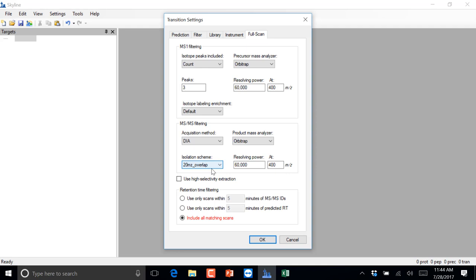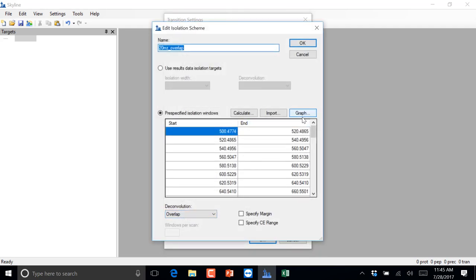So does anybody have any questions on that method before I get into some more details? Does that make sense? Can people go home and do this? About the loop count? Yeah. So if you had 21 and 20... Yeah, it should be 21. I took a shortcut there. It should be 21 for both? Yes. Well, both, because one is 20 and the other one is... oh, okay, yeah. So how do you deal with the MS1 scan? Yeah, so, sorry, I was kind of lazy in my explanation there.